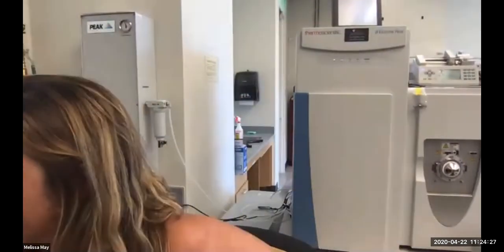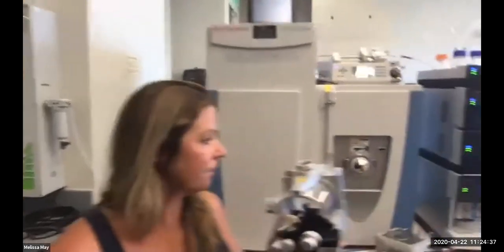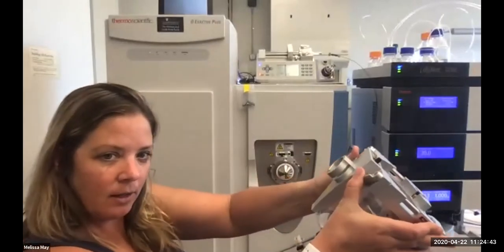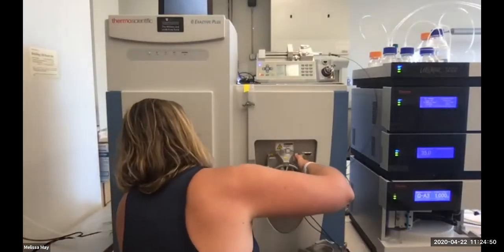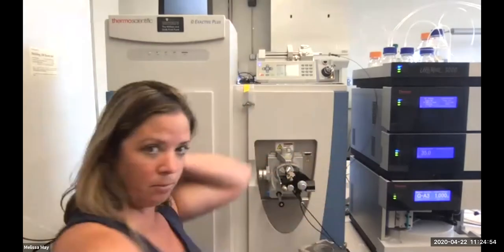The other source that we have, which we use for proteomics, is our NanoFlex source. It looks a little different, so let's hook this up. To put these on, there are little flappy wings, so you want to make sure those bars are aligned. You have to give it some force to put it on.